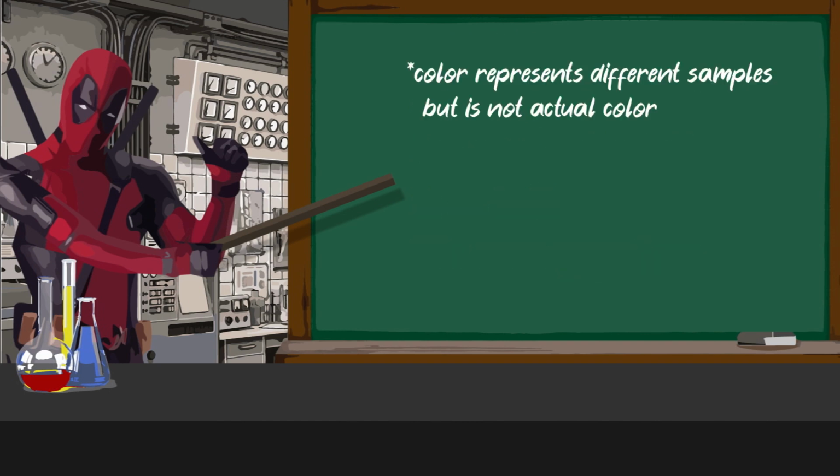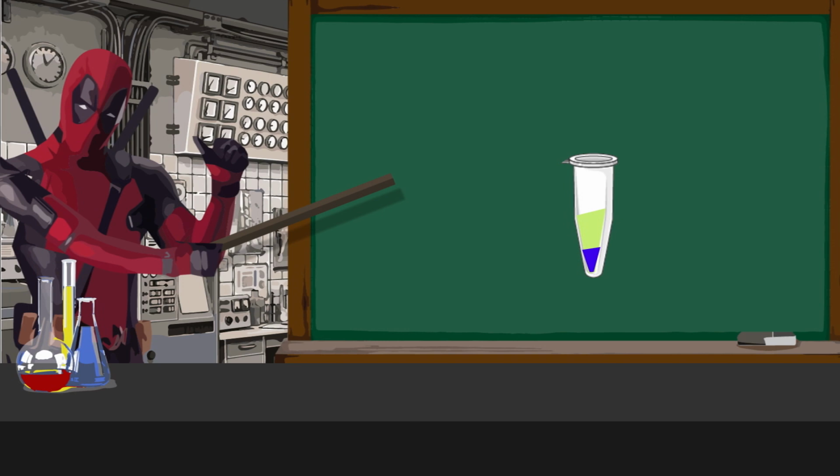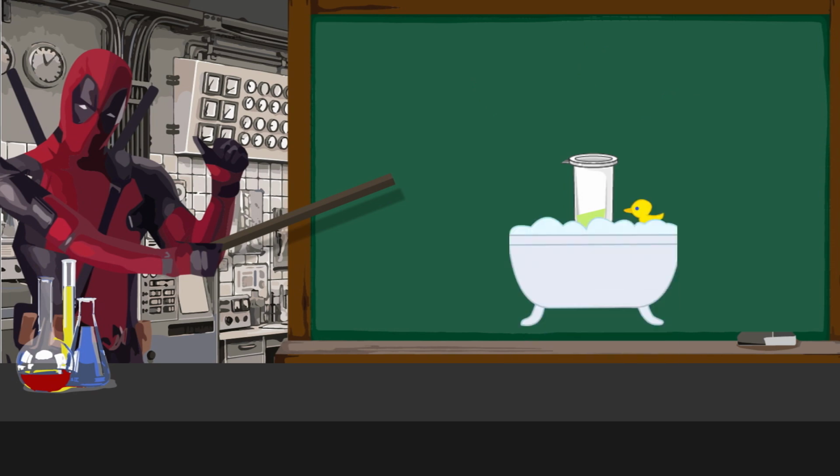To start the process, add 5 microliters of plasmid to 50 microliters of E. coli in a test tube and let it settle for 5 minutes at room temperature. Once it's settled, transfer the microcentrifuge tube containing the E. coli and plasmid to be heat shocked at 42 degrees Celsius for 50 seconds, and then transfer it to an ice bath for 5 minutes.